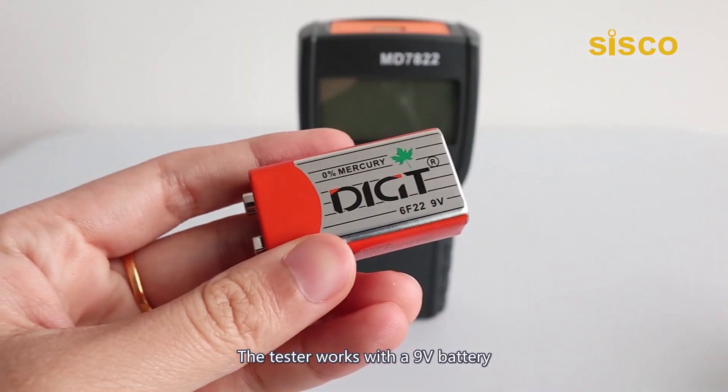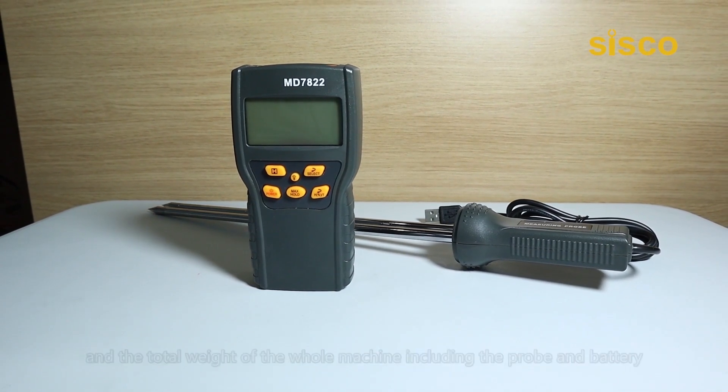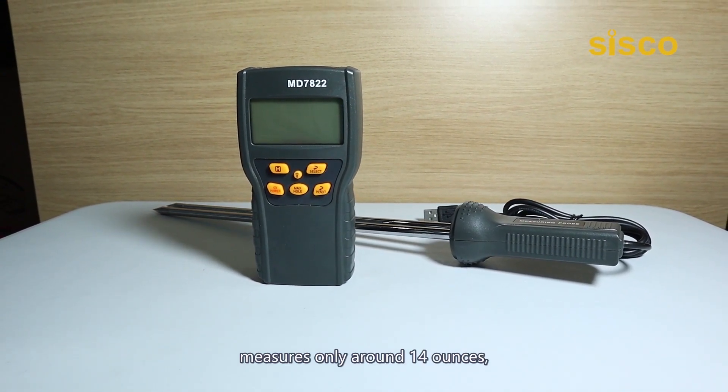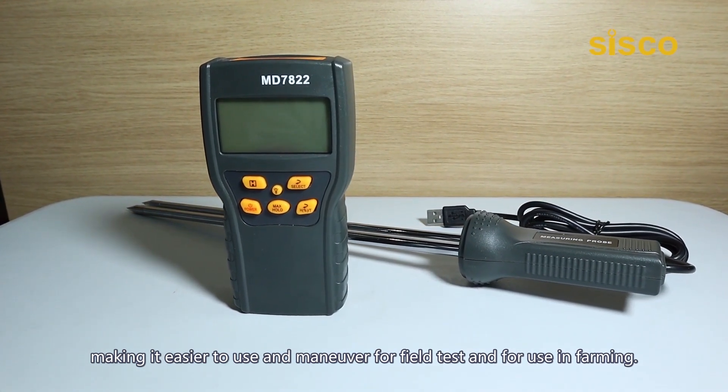The tester works with a 9V battery, and the total weight of the whole machine, including the probe and battery, measures only around 14 ounces, making it easier to use and maneuver for field tests and for use in farming.